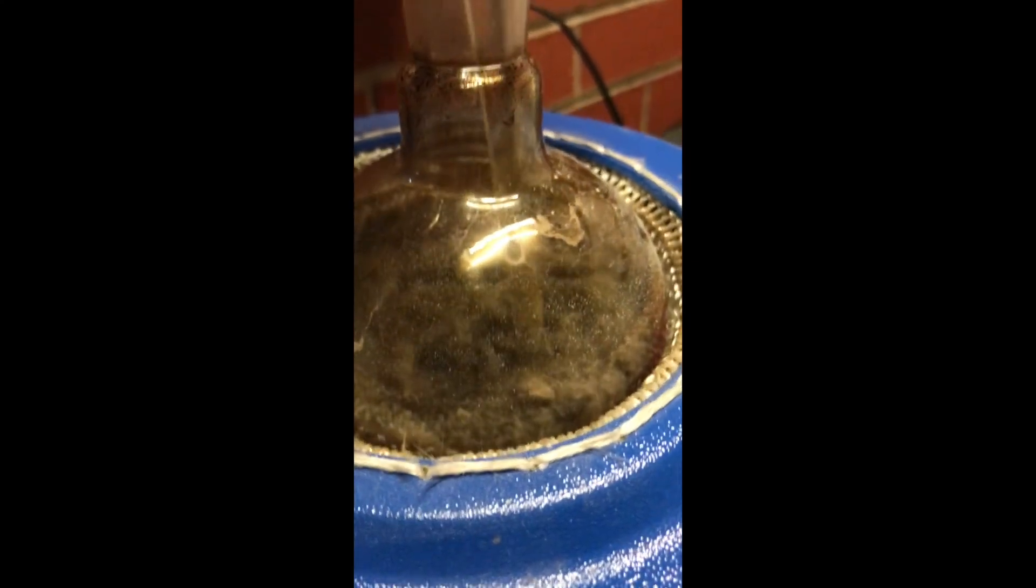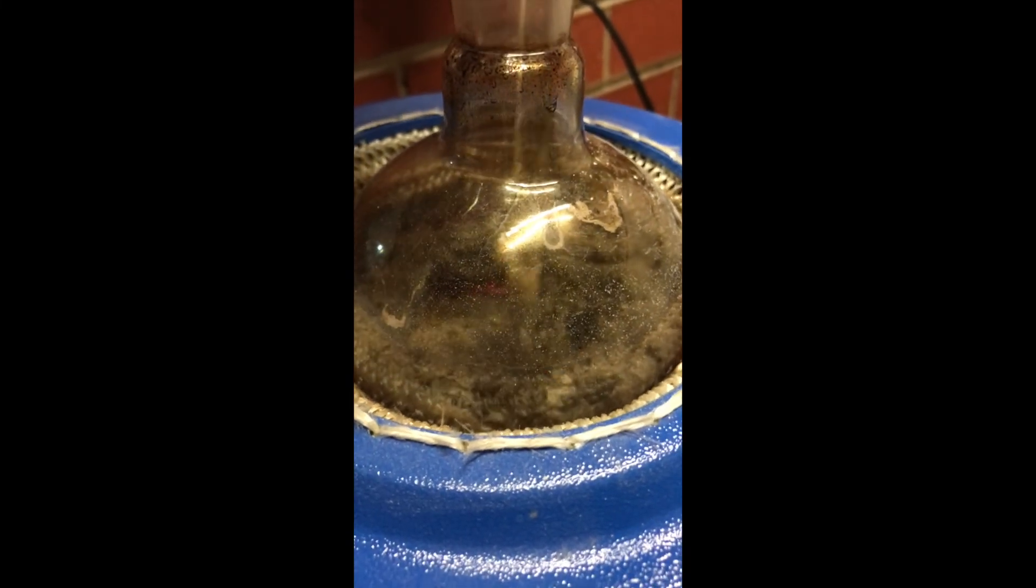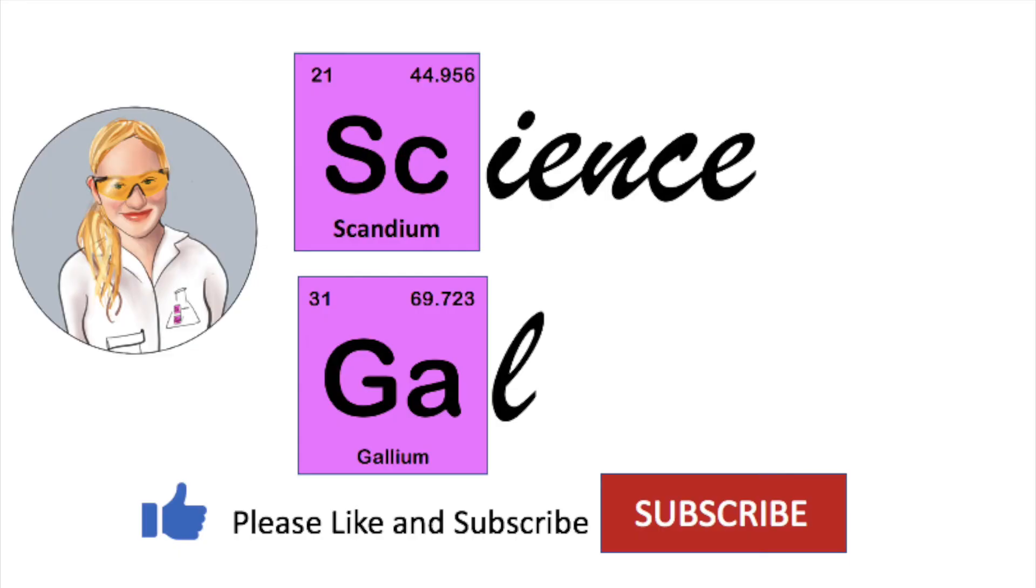Throughout the experiment, the calcium carbonate remained white, however it turned black after it was exposed to oxygen. I forgot to mention, but at the end, I had 35ml of acetone made.